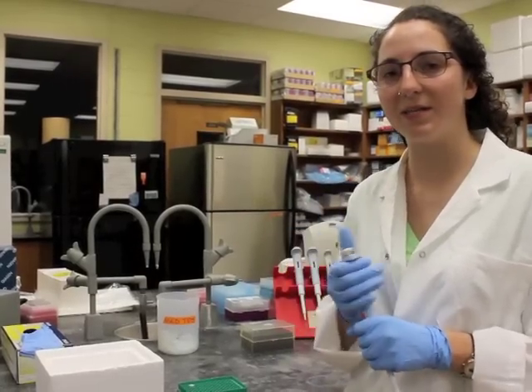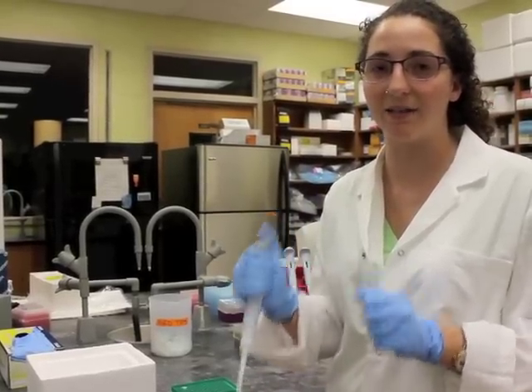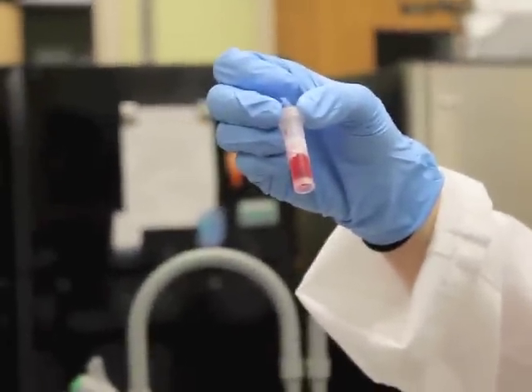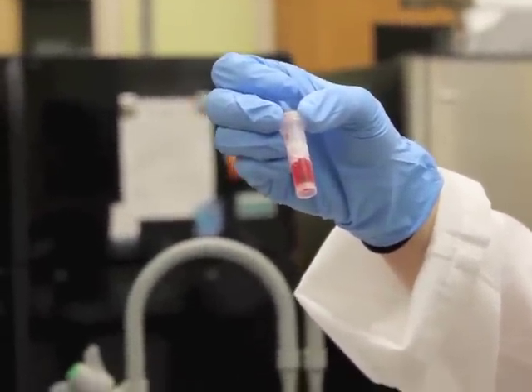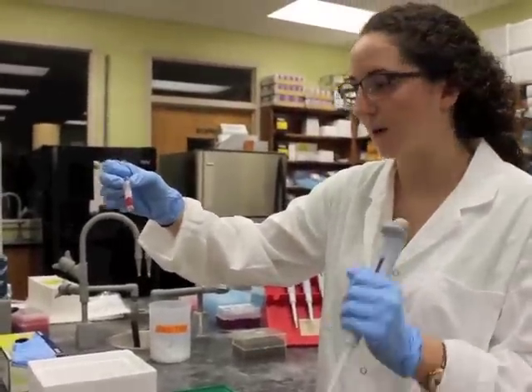When your PCR reaction is finished, you can load it directly into the gel and you won't have to add a dye in order to see it. It's this red dye, and you include it in your reaction mix. That way, when you load your reaction onto the gel, you can see it — you can see your reaction in the gel because it's red.